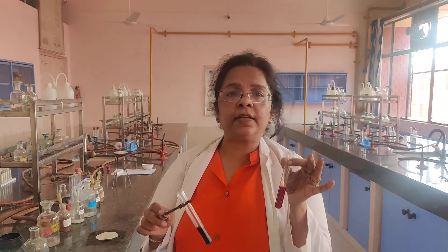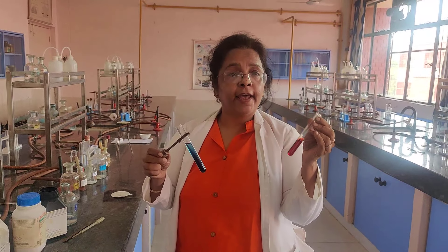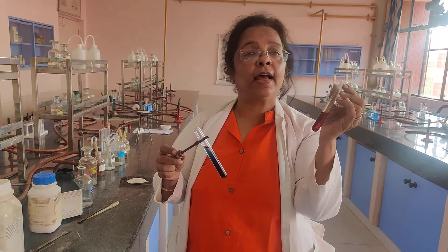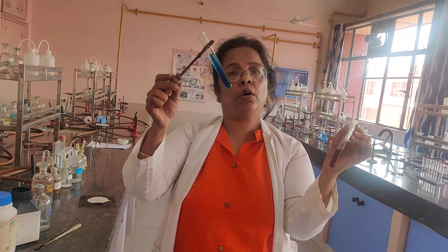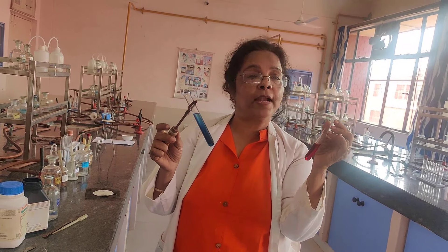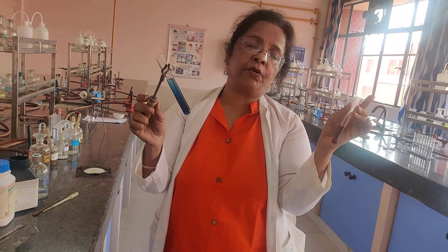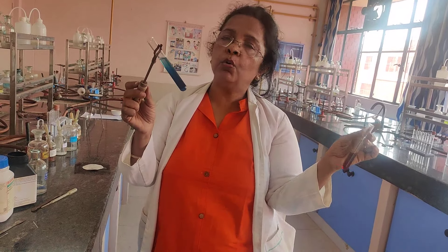In case, while doing the test, instead of blue you get a red color, that indicates the compound has both nitrogen and sulfur. So that is the test for nitrogen, and also the test for sulfur in your organic compound. With this I close today's experiment, where we prepared the Lassaigne extract, did the test for nitrogen, and if nitrogen and sulfur are both present, you would get red instead of blue during this test.